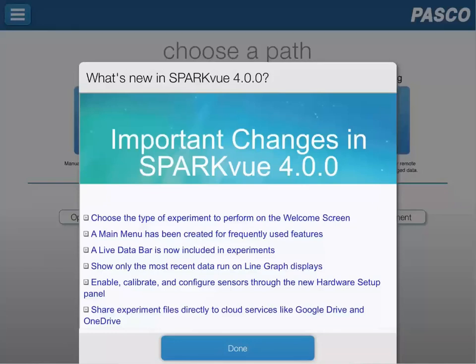Hi and welcome to SparkView 4.0. On the first launch of SparkView 4.0, you'll be presented with a welcome screen that presents many of the new features that are available within this new software package.